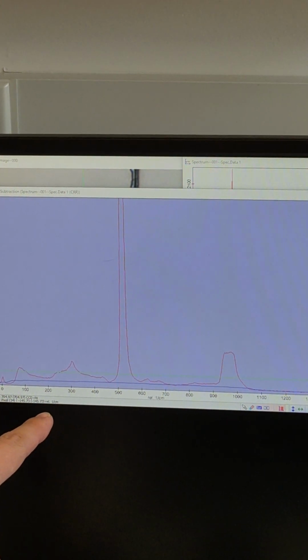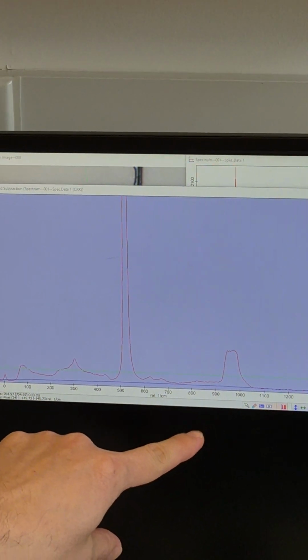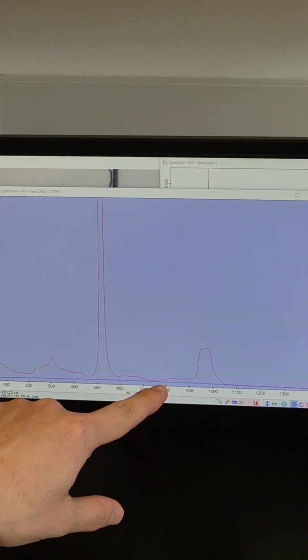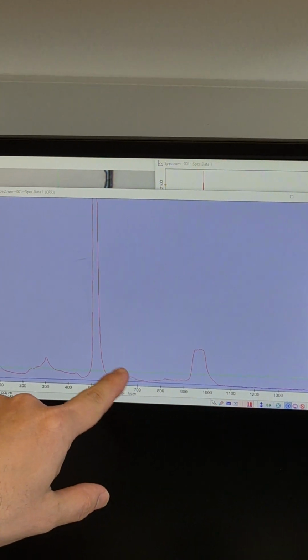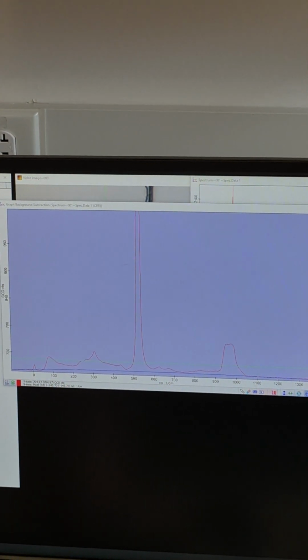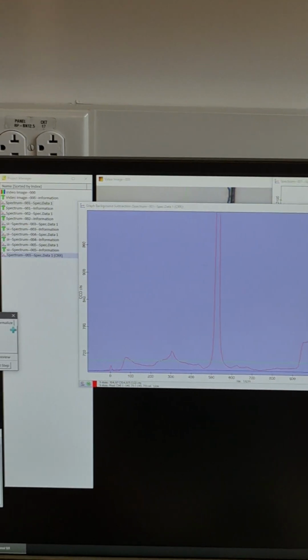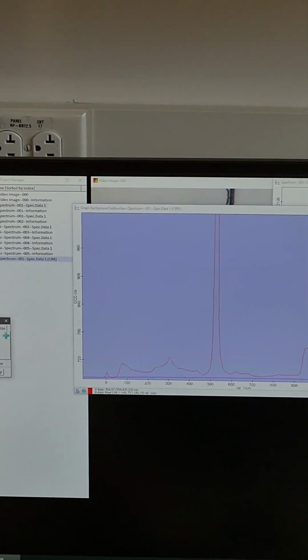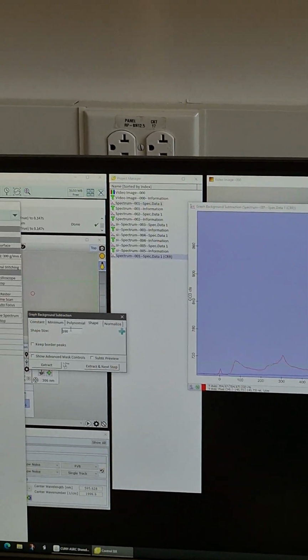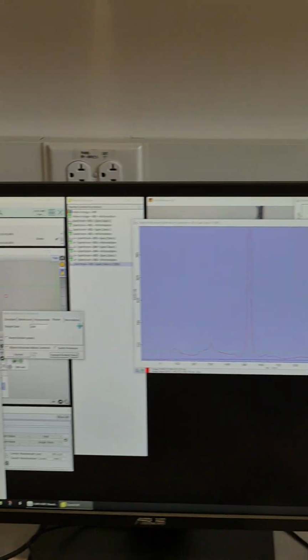This is just based on your observation. You want to make it flat, not too flat, away from the background, and also it does not cut into the peaks. Normally a shape size in the 100 to 200 range is good for most of the peaks. So somewhere around here. If you're happy, you just do the extract and the next step.